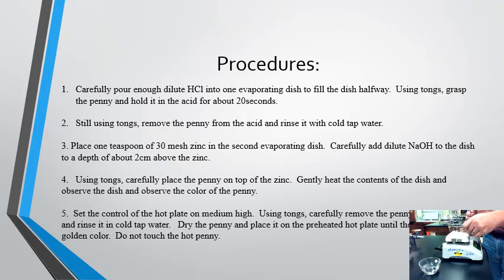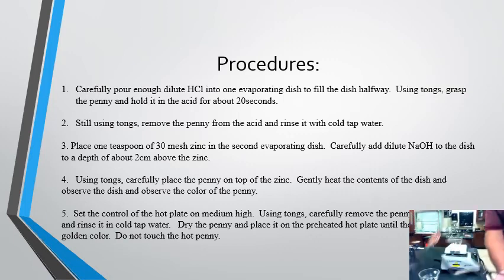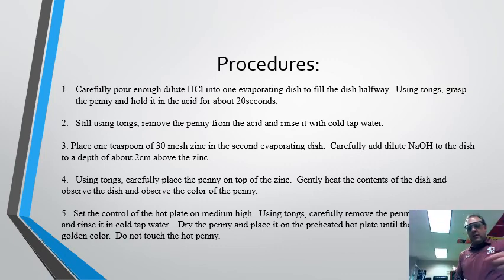So please make sure, same thing, when you're taking the penny off of the hot plate, use your tongs to pull them off and place them into the cold water. You can just have some of the water running in the sink the whole time, just not on high, but just turn it on kind of low. You'll hear it sizzle. Leave it in there for probably about 10 to 20 seconds, and the penny will come down to room temperature where you'll be able to touch it. At that point in time, you should be good to go, and you can just stick it into your pocket, and that gold penny should stay that way for years to come. So that will be our lab for tomorrow.